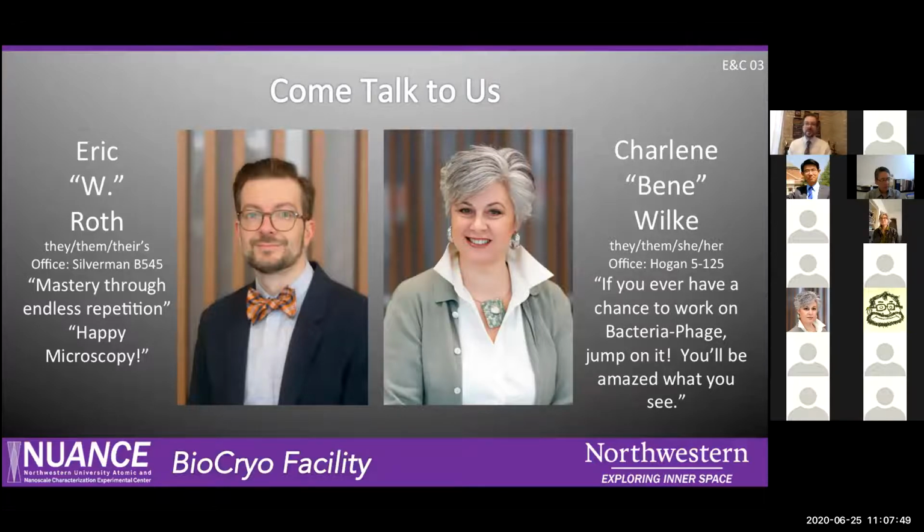So I'm going to pass it off to Charlene here. Go ahead, Charlene, introduce yourself. Good morning. Welcome to the Tech Talk. I'm Charlene Wilkie. I've been at Northwestern for more than 10 years. You've probably seen me around. I'm still in the Hogan building on the 5th floor, right next to the JOLTM room. I guess welcome to negative staining. And my little blurb on it is, if you ever have a chance to work on bacteriophage, jump on it. You won't be disappointed.